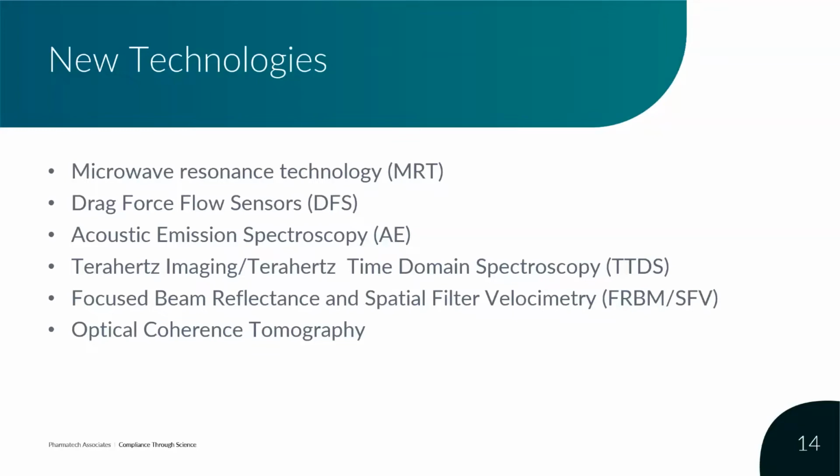Optical coherence tomography. This is like an ultrasound, except instead of sound waves, you're going to use light. And using that, you can image internal structures that can provide you a lot of data on what the internal structure of your tablet looks like, and thus what you can expect the critical quality attributes of that finished product to achieve.